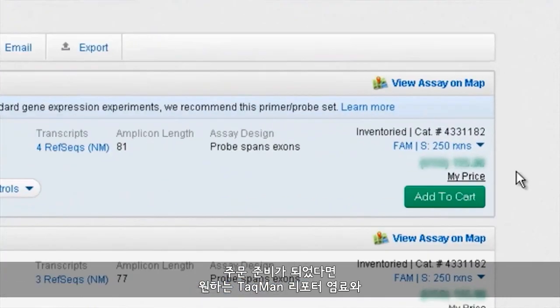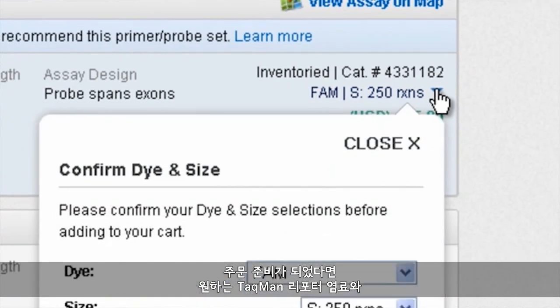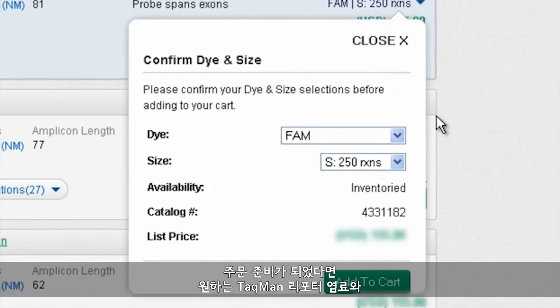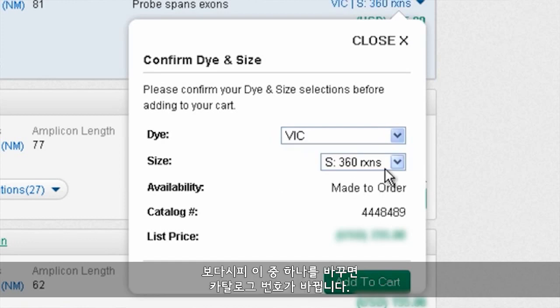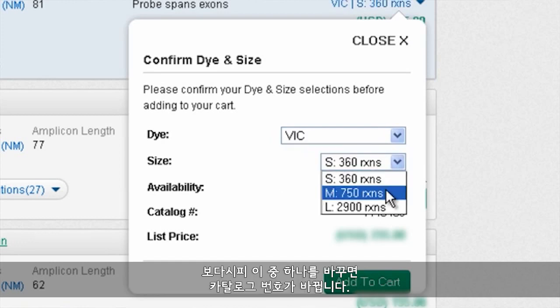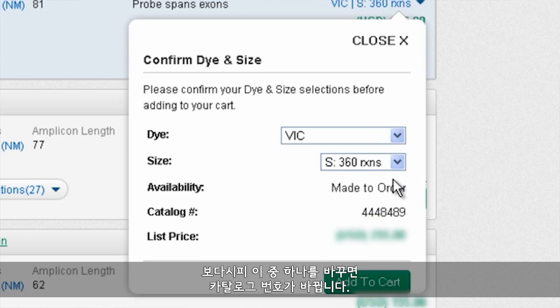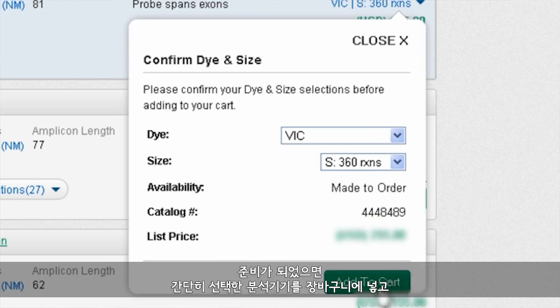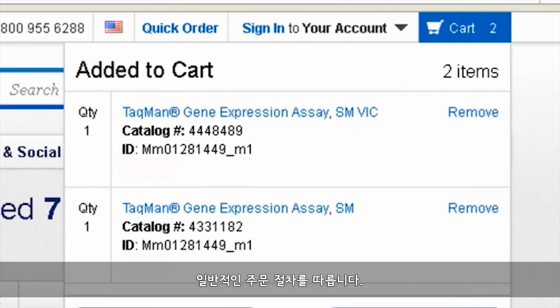Once we're ready to order, we'll need to choose our preferred TaqMan reporter dye and our assay size. As you can see, changing any of these also alters the catalog number. Once we're ready, we simply add that specific assay to our cart and then follow the normal procedure for completing our order.